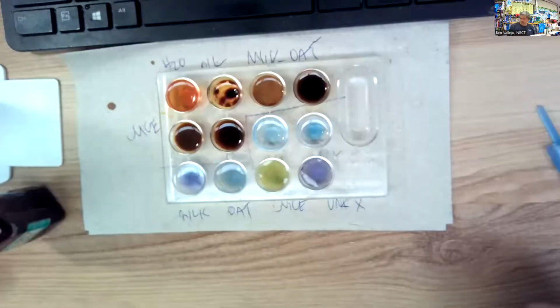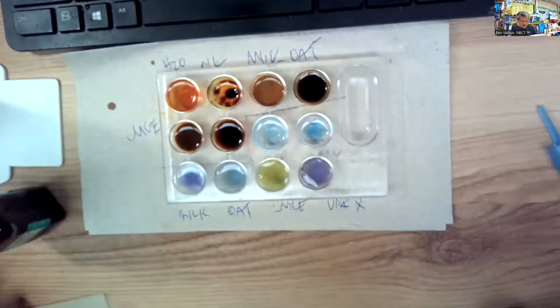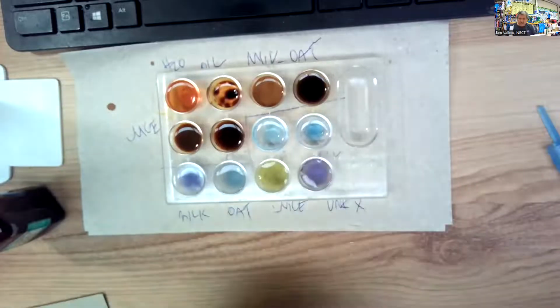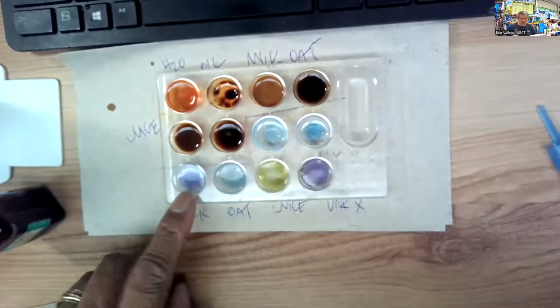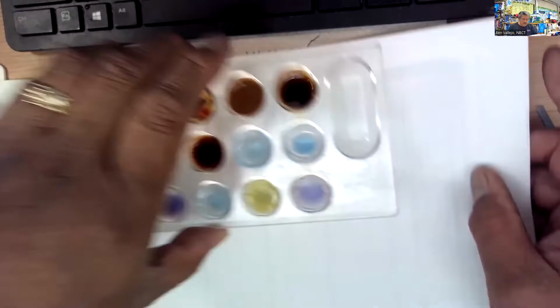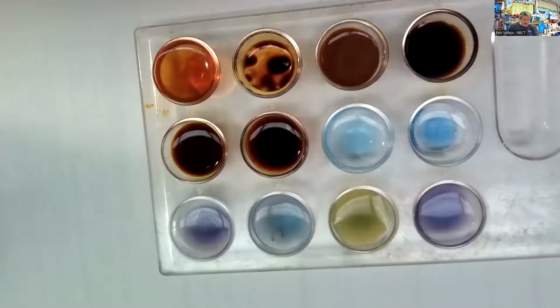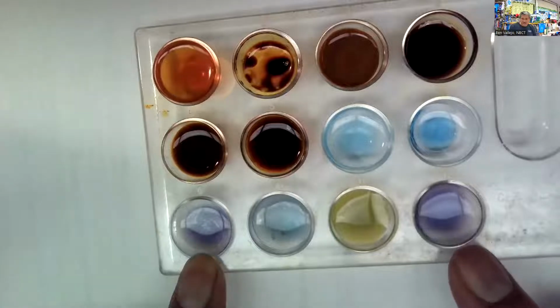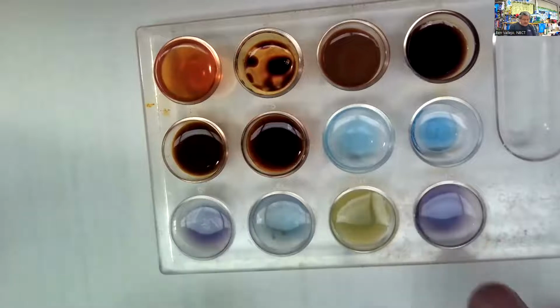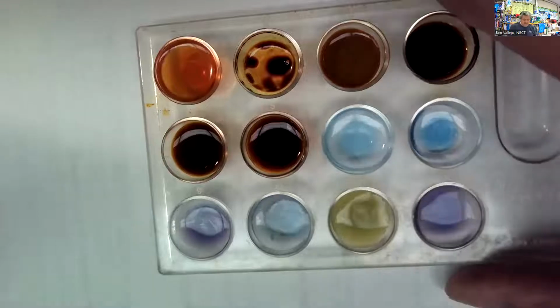of our picture. Sometimes this works better when you have a white background. So I'm going to slip this under. You can see that the water and the oil, definitely not. Milk is purple. This is milk, oat, juice, and unknown. So having done that, you can see that the milk and the unknown both have a positive test for the Biuret test. Remember, Biuret test for the presence of a protein.